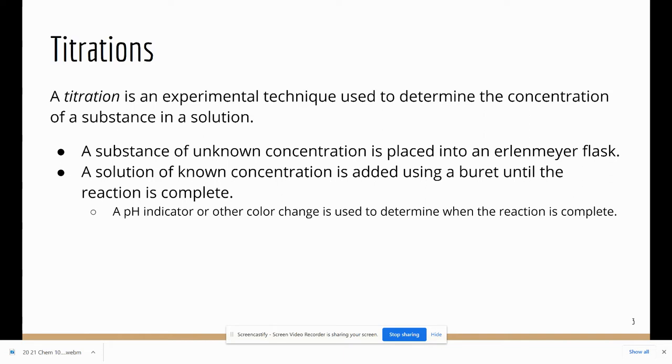I am going to demonstrate and show you how to do a titration in the lab. It's actually my favorite lab to do with students. I think it's such a cool lab. So we'll do that physically together in the lab, but our goal here is to figure out how to do the calculations. They're just stoichiometry calculations, but with a couple of steps we haven't necessarily done all together before.